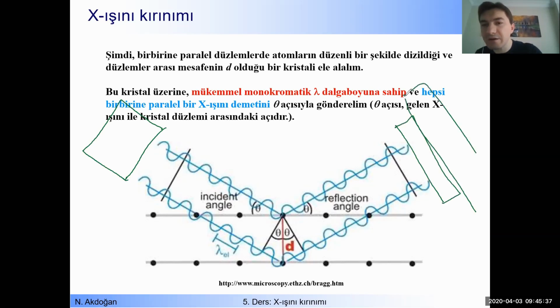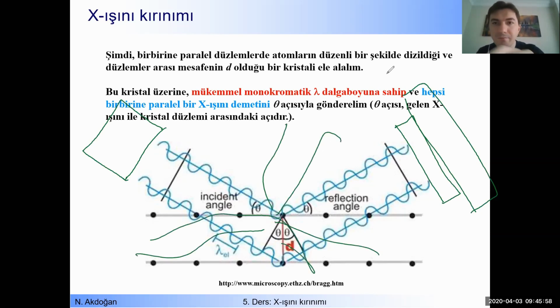Detector is waiting there. Okay, so X-rays enter the material and they are reflected with the same angle. But this is the ideal case. Just don't forget that there are also many other X-rays scattered everywhere, okay, in 4 pi.